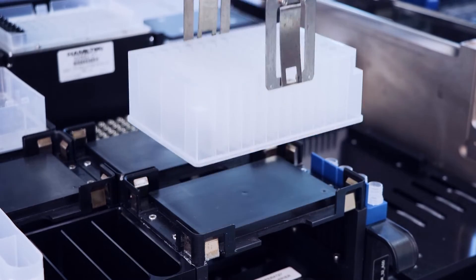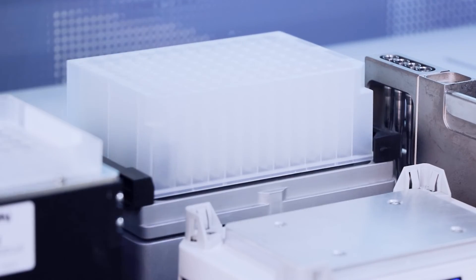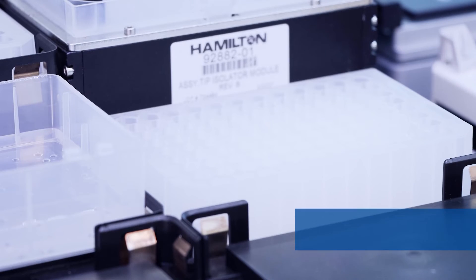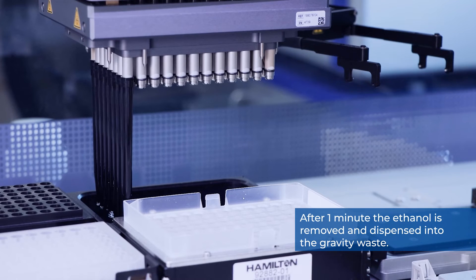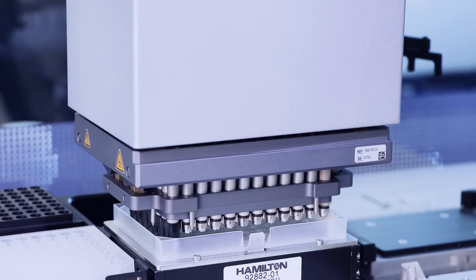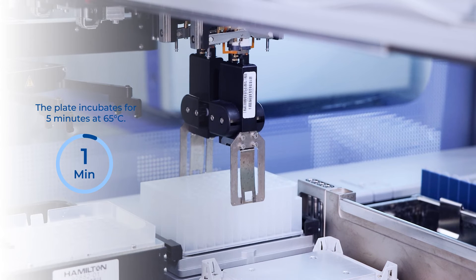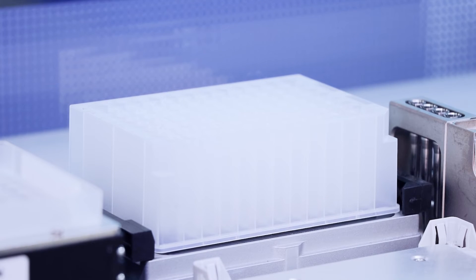The sample plate is transferred to the shaker and vortexed for one minute before being transferred to the magnet. After one minute, the ethanol is removed and dispensed into the gravity waste. The previous three steps are repeated two more times for a total of three washes with 70% ethanol. The sample plate is then transferred to the heater and incubated at 65 degrees Celsius for five minutes to evaporate excess ethanol.